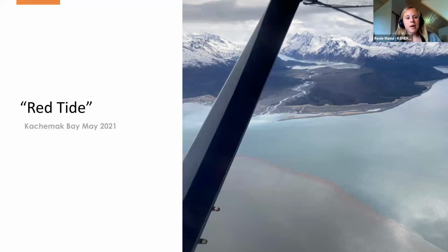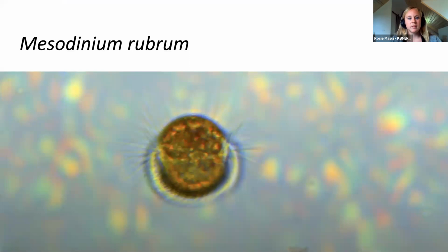We were able to go out and get a sample, and Thomas, if you go to the next slide, this is what we were seeing underneath the microscope. And Dave kind of set this up for me pretty perfectly. So what we were seeing was this marine ciliate. And so ciliates, these are these planktonic guys that have cilia. And so you can kind of see those little hairs around this guy. Yep, Thomas is pointing to them. And those are used to help them either move around in the water or to go and grab food.